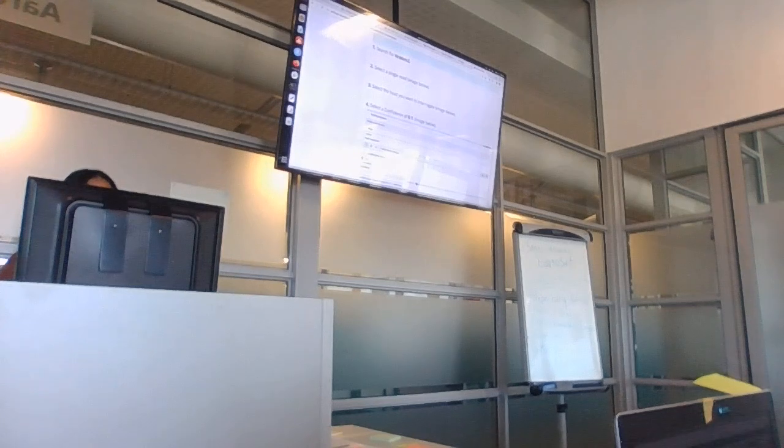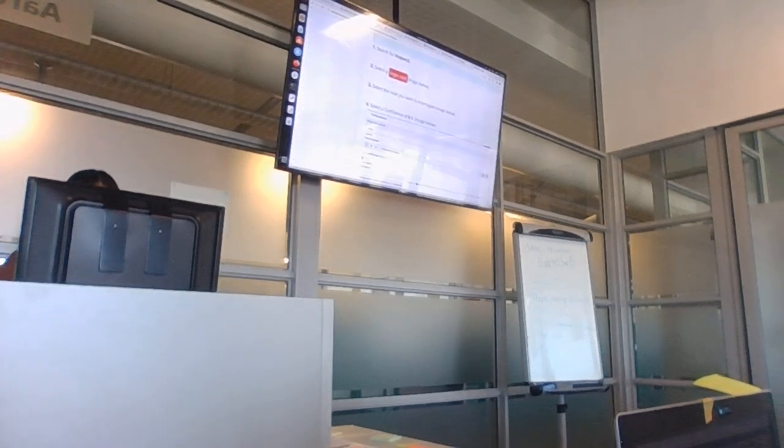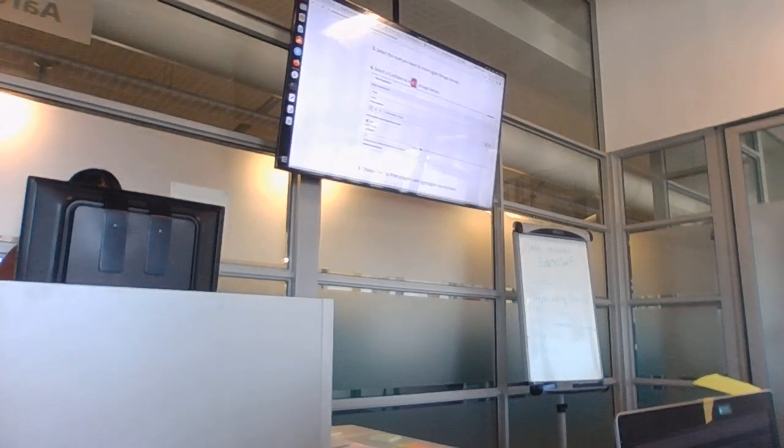So you would obviously in this case select a single read, and it automatically falls into the one that you want to run it on. You then change the parameters. I just left it on default, 0.1. By default I mean the default one that I took from a tutorial. It's on 0 in your version, so that would be 0.1.